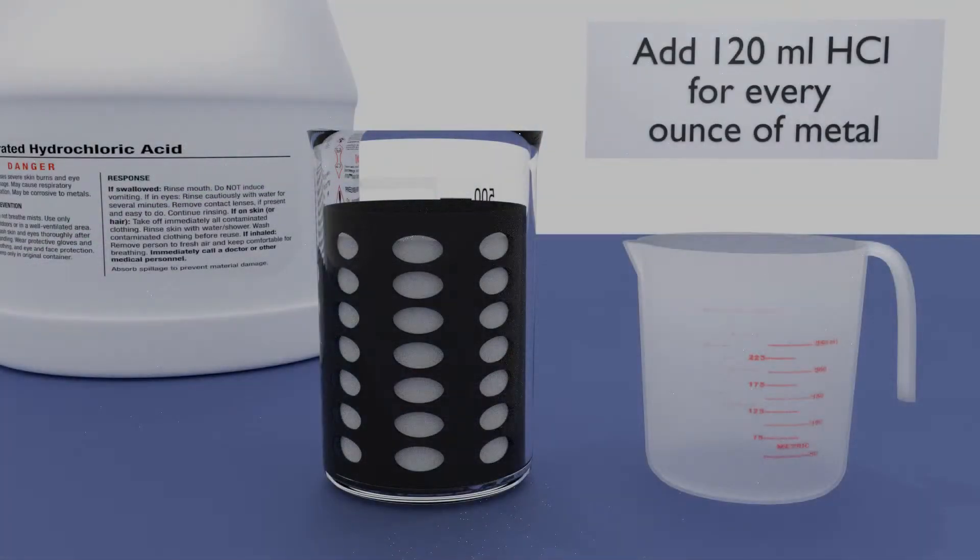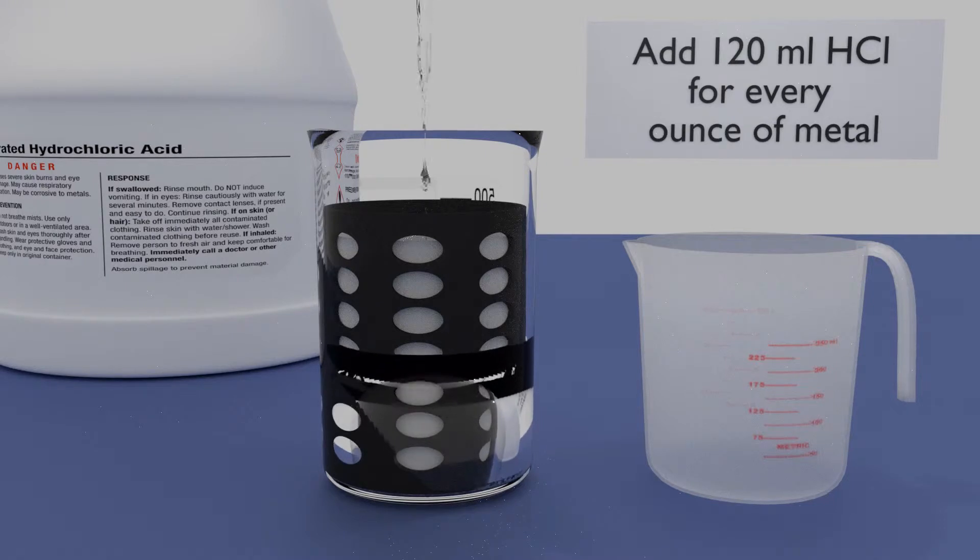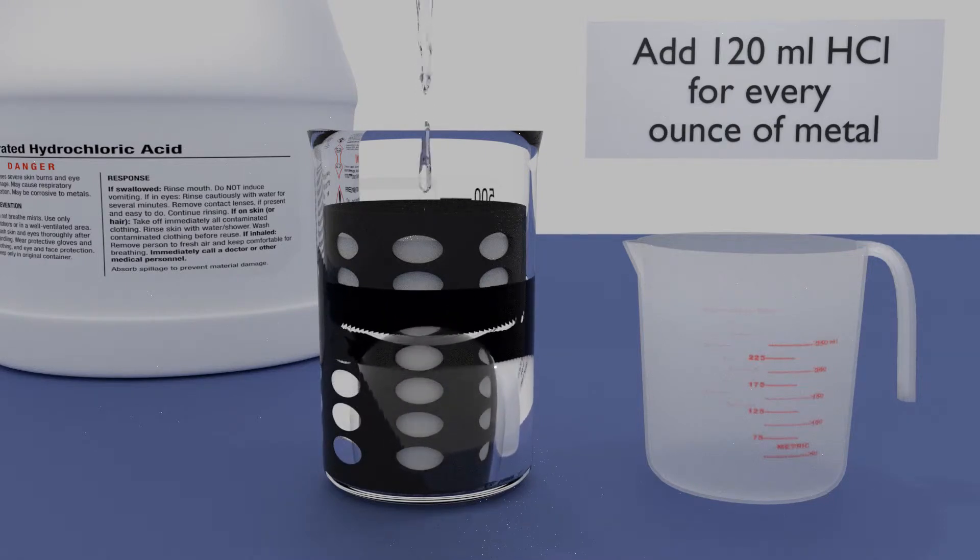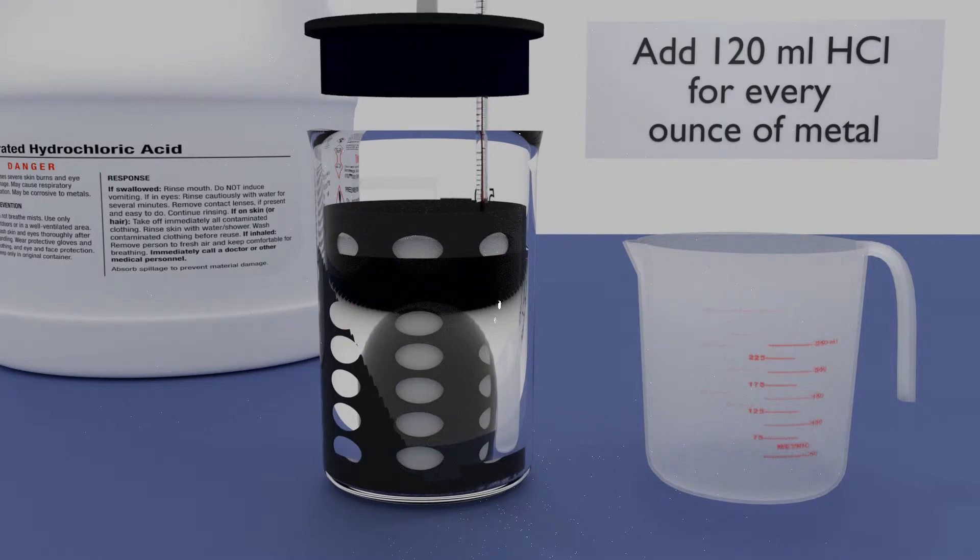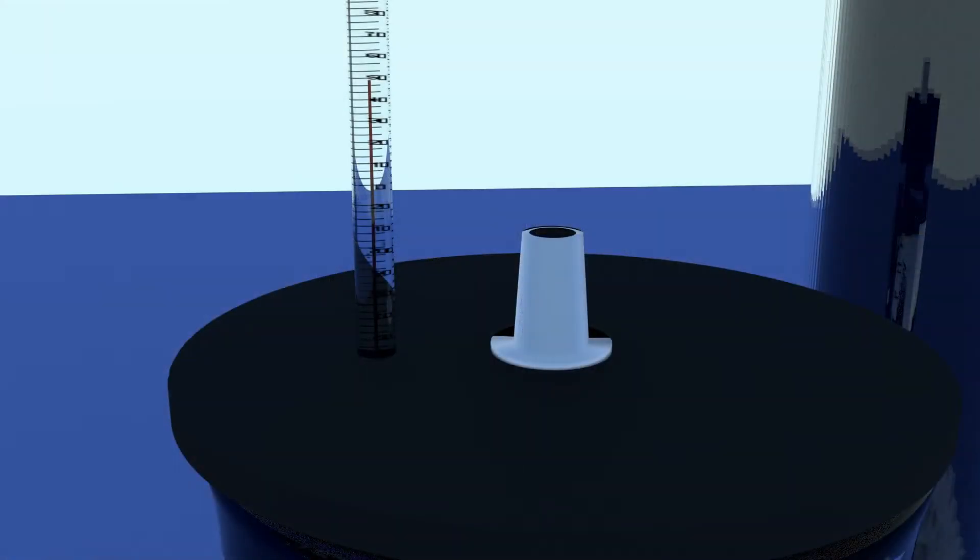Take the beaker to a well-ventilated area, preferably outdoors. Add 120 ml of hydrochloric acid for each ounce of metal. Replace the cap and bring back indoors. Connect the quick connects. The fumes will now pass through the scrubber, removing both their smell and corrosion.